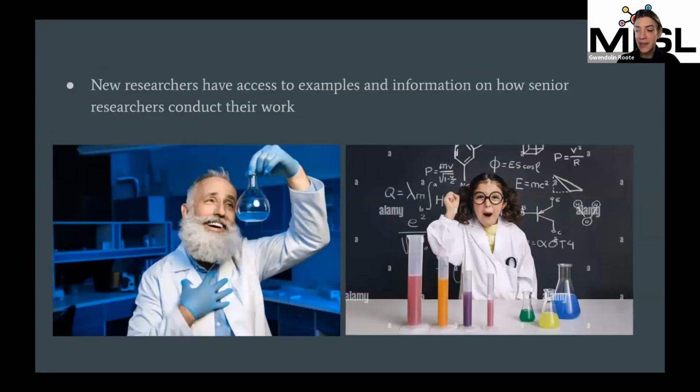Another thing I love about Sample Manager is that new researchers have access to examples and information on how senior researchers conduct their work. So starting a new lab notebook, starting a new experiment, getting into research for the first time, a lot of students feel kind of overwhelmed, maybe like they don't know exactly what they should be doing, especially when it comes to recording their information.